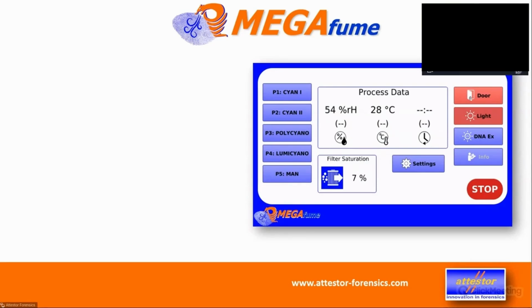If we go further, a bit right of the center, you see a button that's settings. That's where you program the individual steps. And you have to be, let's call it, a supervisor or a super user to be able to save the settings. Everyone can go in there to see what the parameters are, but in order to change them, you have to use a password. And then left of that one, you see an icon that says filter saturation.